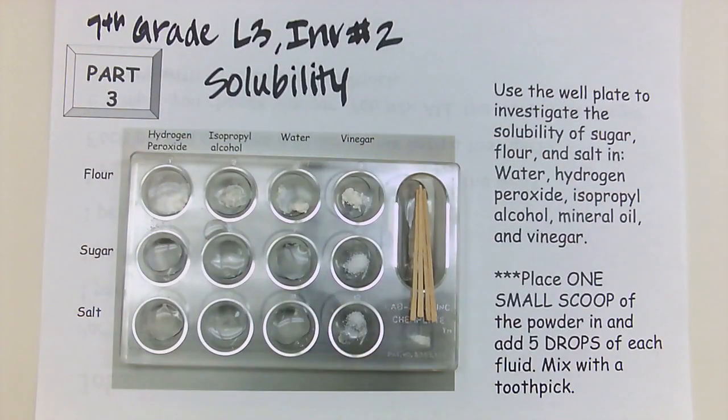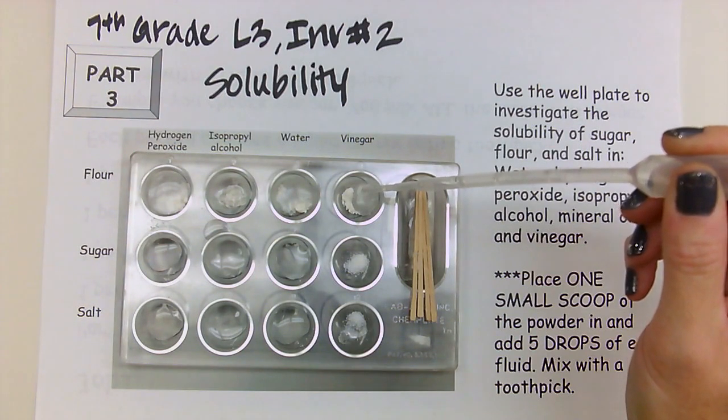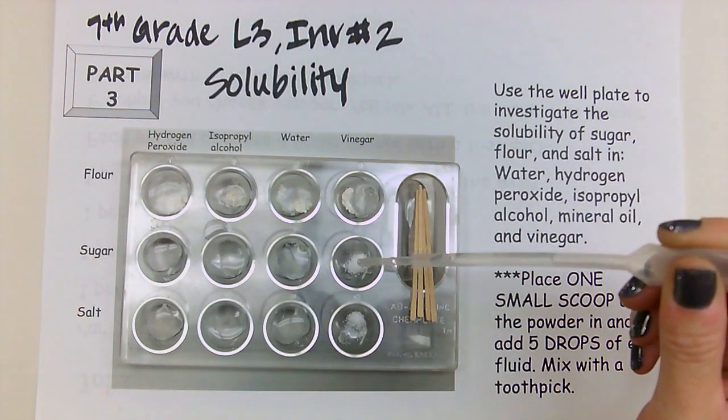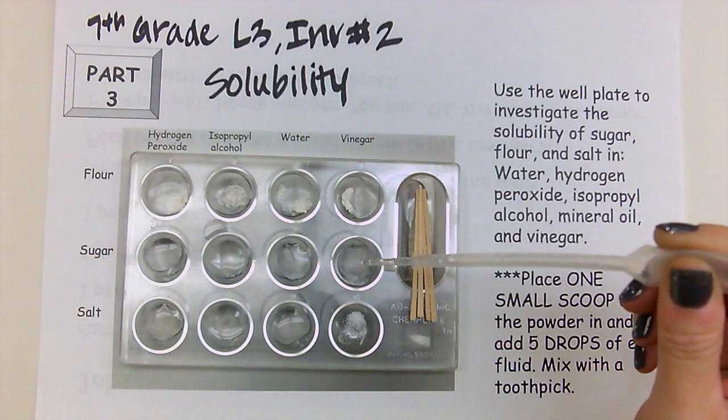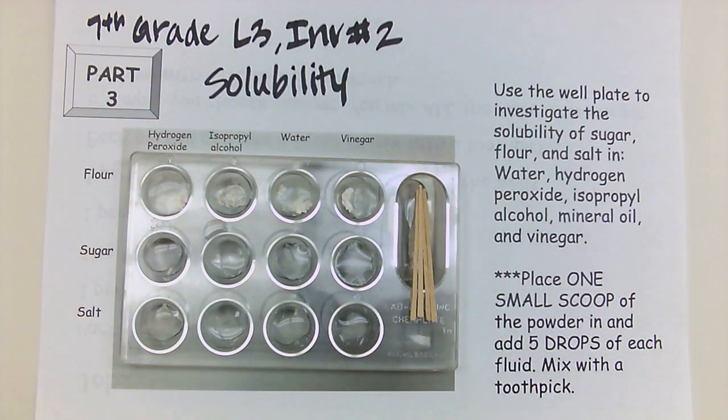Okay, and then you have vinegar. Okay, last but not least, the vinegar. Oh, I need a little more. Okay, I have 5 in each one.